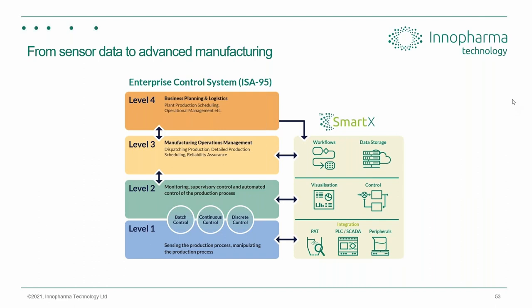The transfer bottles will be washed with the same solvent. Yes. So in this case, the alcohol is the solvent of the reaction. Very frequently, IPA is used just for cleaning because it's a decent solvent, and in the case of electronics, because it's not conductive. So alcohol in this case is used for cleaning, not as the active pharmaceutical ingredient. The active pharmaceutical ingredient in this case is the paracetamol. Yeah, very good, very good.